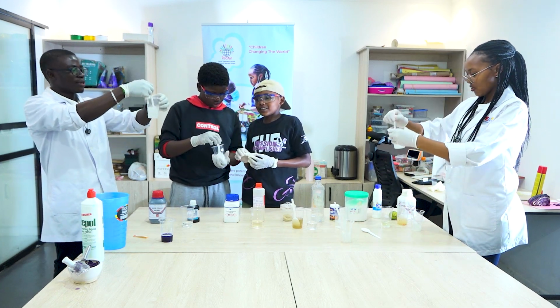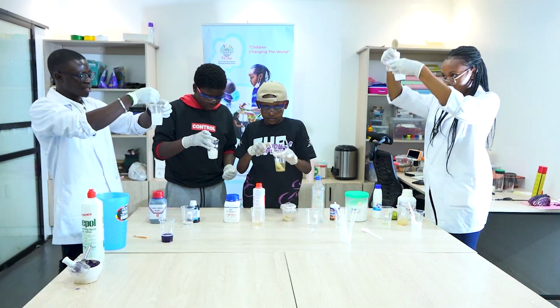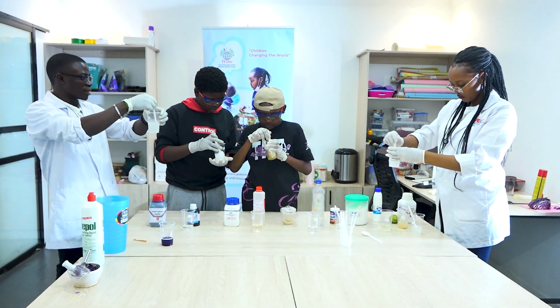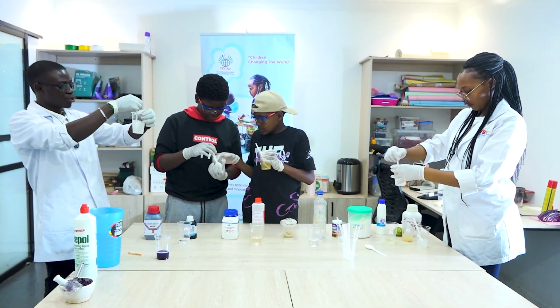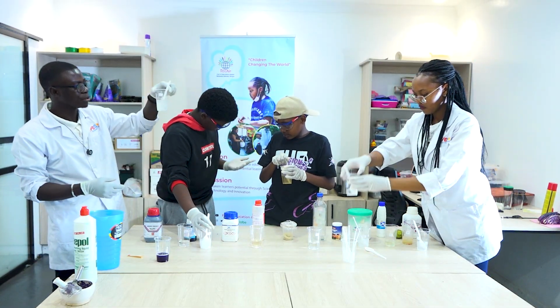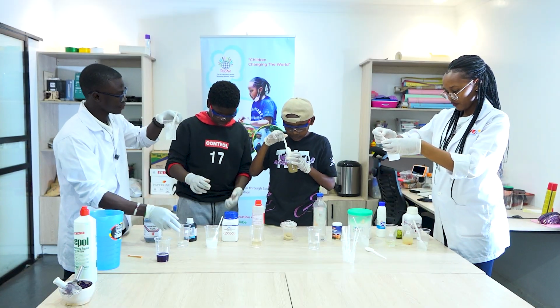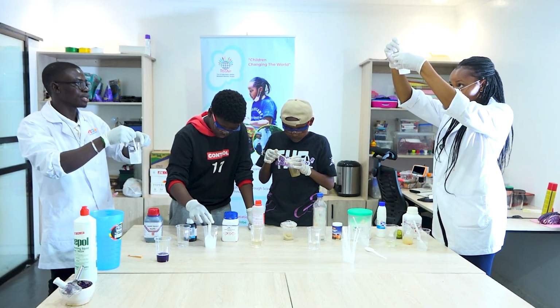Okay, so that way, dissolve it all. Just stir it so that it dissolves. And one thing you're going to notice with some of this is that they look cloudy right now, but after everything is dissolved, they're going to be colorless, actually clear.